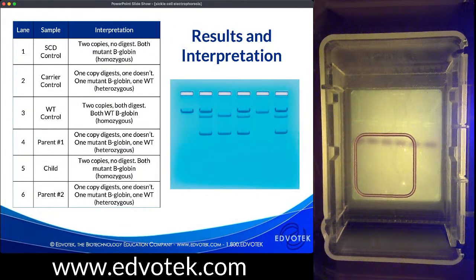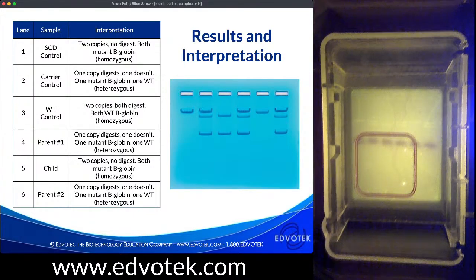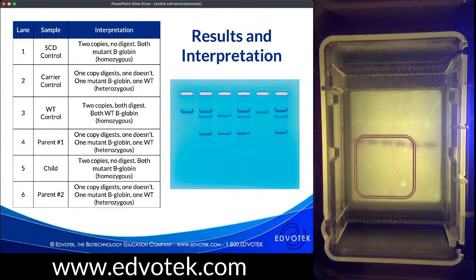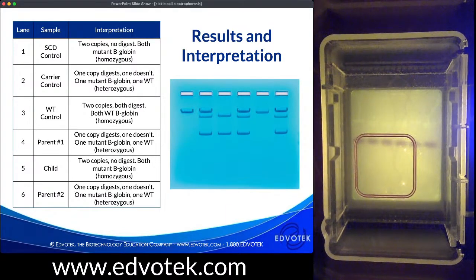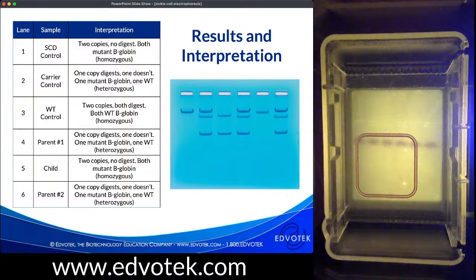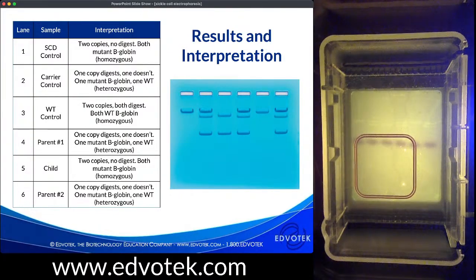Okay, so let's take a look at our results from this experiment. The gel just turned off. It's been going for 30 minutes. And what we can see when I have the light on, it's a little bit faint here. And I think, again, because there's ambient light in the background here, I don't know if my camera is picking up the bands as well now that they're a little bit further apart. I can see them really well on my gel when I look at them.